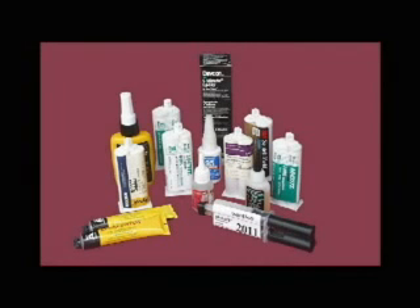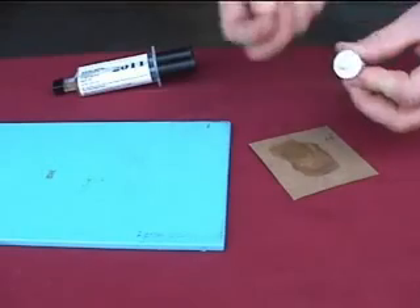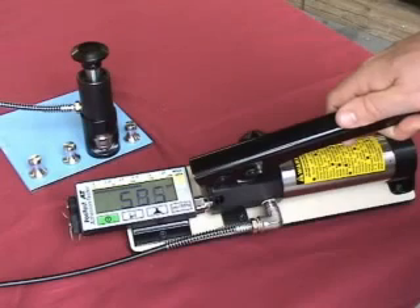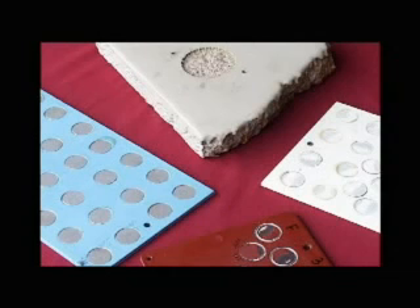To conclude, the pull-off adhesion testing process is made up of several critical steps. These include the selection of an appropriate adhesive, preparation of the dollies and coatings, adhering the dolly to the coating, the dolly pull-off process, and the final analysis of test results.